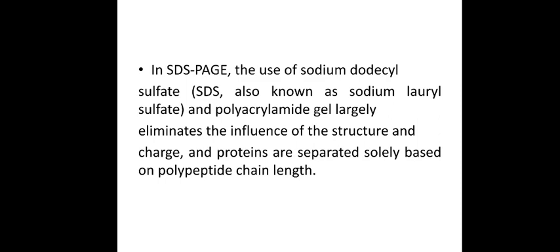There is one more technique which is similar to our agarose gel electrophoresis, that is called SDS PAGE electrophoresis. Here SDS stands for sodium dodecyl sulfate, which is a detergent, and PAGE refers to polyacrylamide gel electrophoresis. Poly P, acrylamide A, gel electrophoresis GE. So commonly known as SDS PAGE.